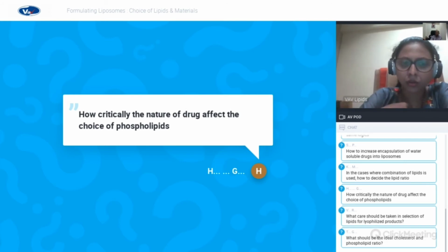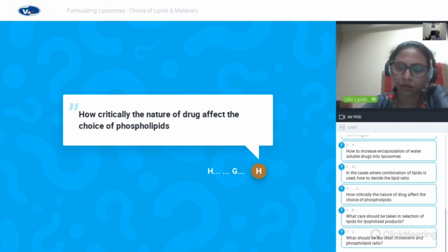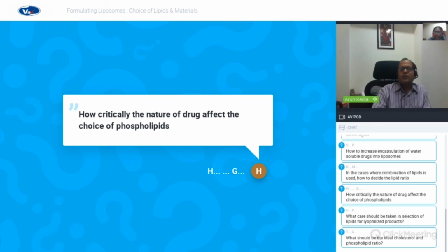So, how critically does the nature of the drug affect the choice of lipids? Quite critically. First of all, your first question is what is the nature of the drug in terms of hydrophobicity or hydrophilicity? This will decide the place in the liposome.